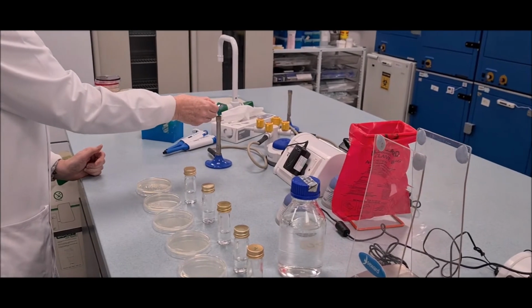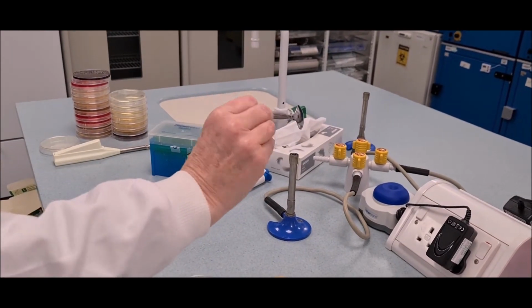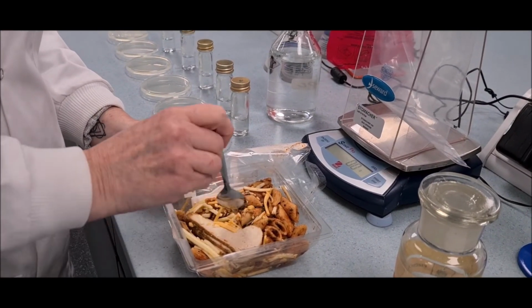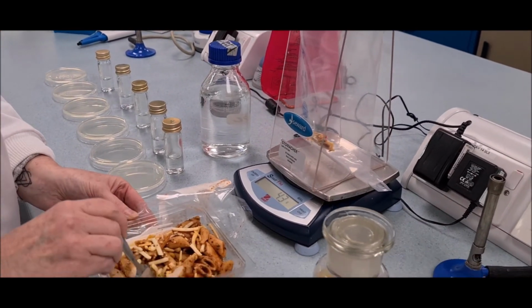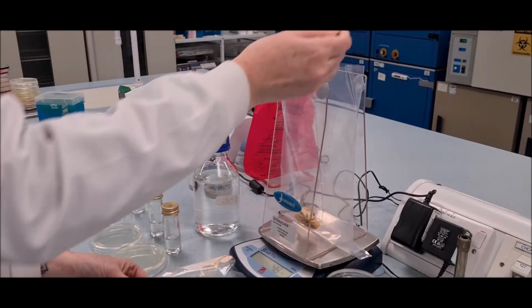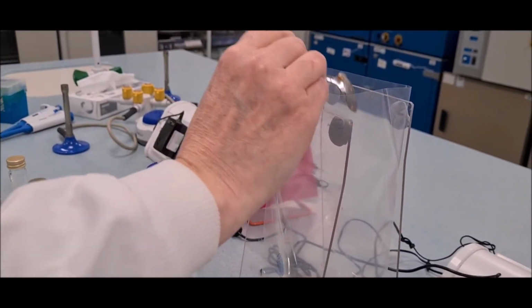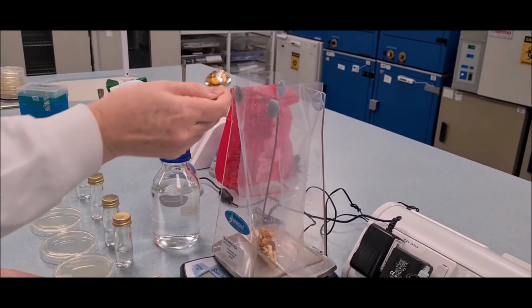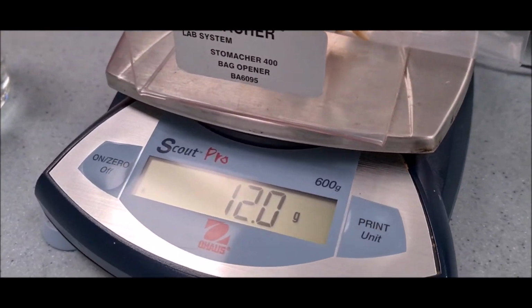Make sure the sample is taken in a manner to reduce the possibility of handling contamination. We have taken 12 grams of food sample.